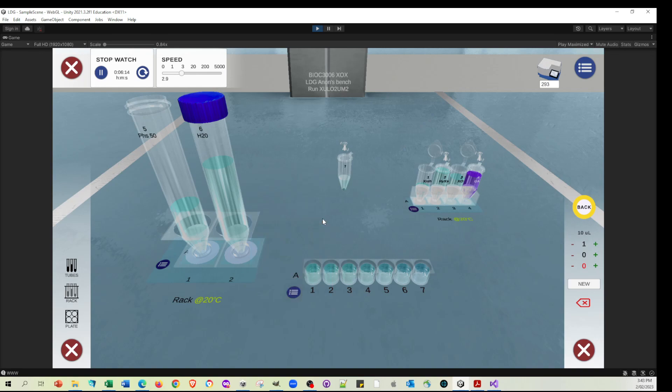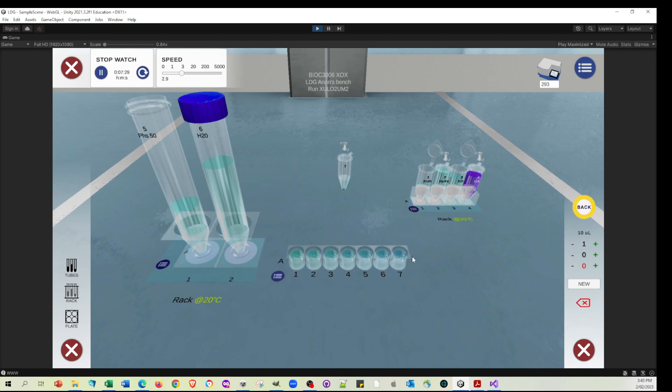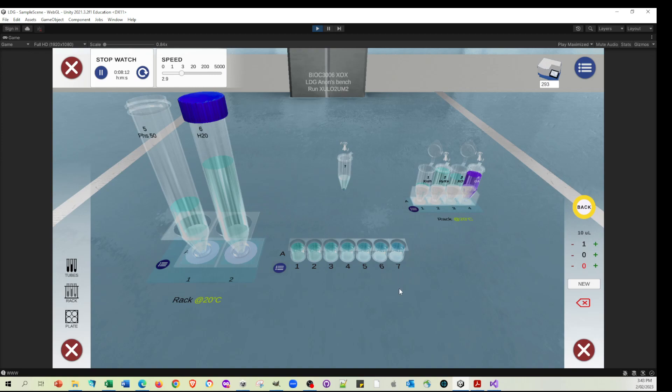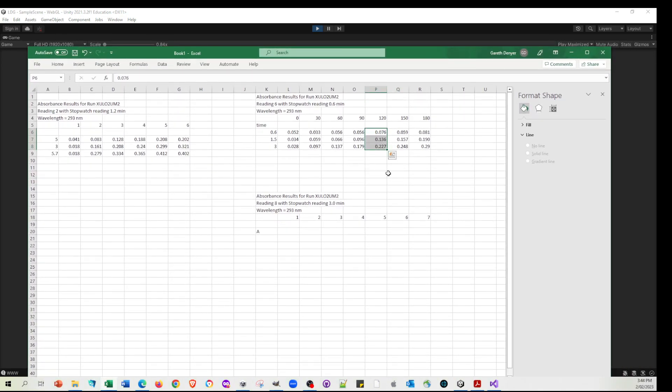So that was very quick. That's really taken, I mean, even in this accelerated time, six minutes, it wasn't that for me to do it. It was about three minutes for me to do that entire experiment. But, of course, there's so many things that we could vary here. We could have double substrates. We can have different amounts of enzyme. We can do all sorts of really interesting things just to play around. But as course coordinator, we can throw in some brilliant curveballs. We can have the enzyme not working very well. We can have a different specific activity. We can mismake the phosphate buffer. There's so many things that we can do to tease students and get them thinking about the data that they're getting. Really nice and authentic. There's nice wobble, there's randomness, but they are authentic when it comes to being reflective of what the students chose to do.